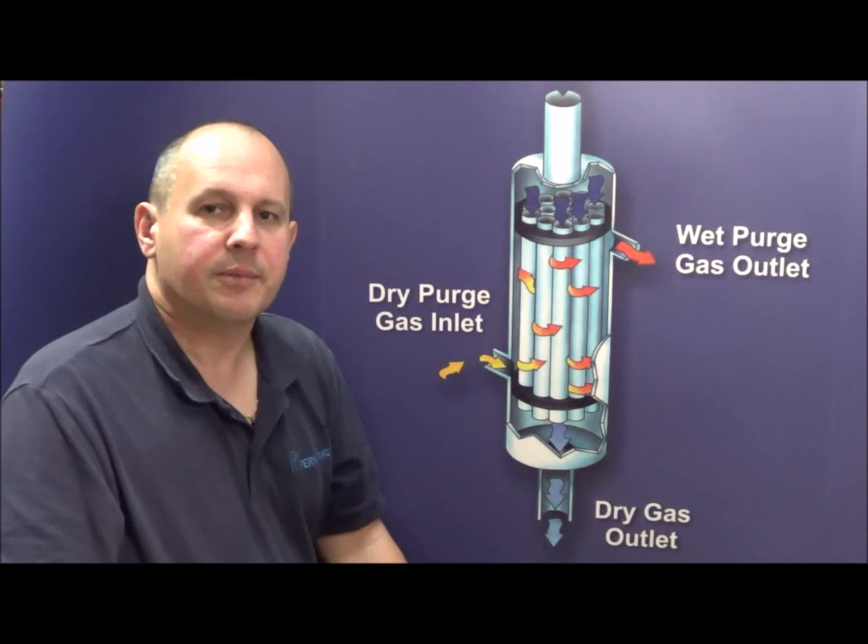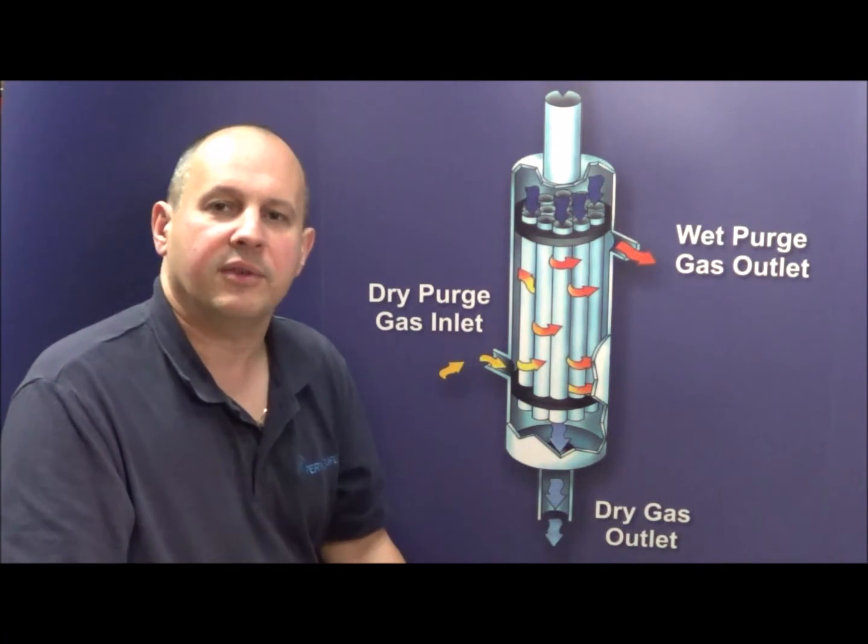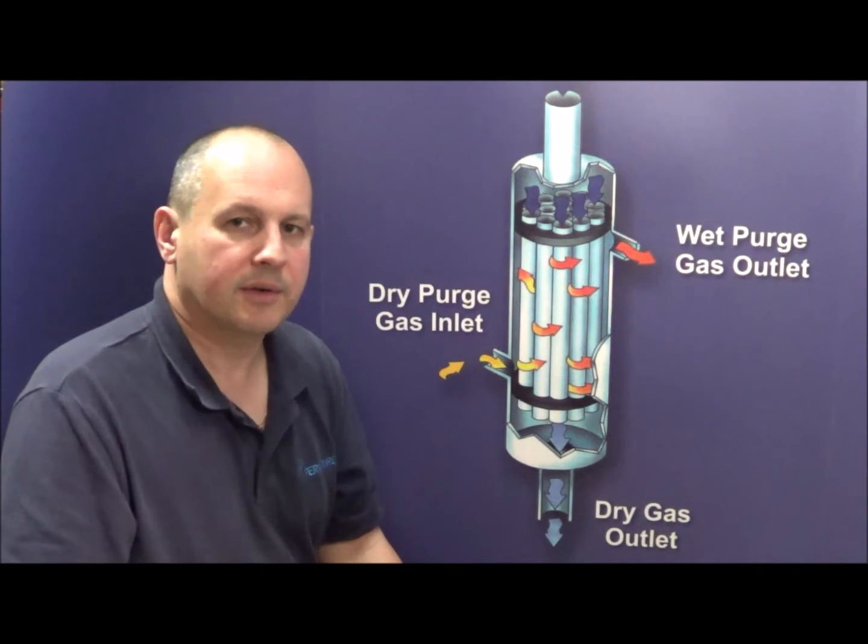Hi, this is Gene Bohensky from Permapure, and this short video was created to demonstrate the basic functionality of our MD and PD series gas sample dryers.